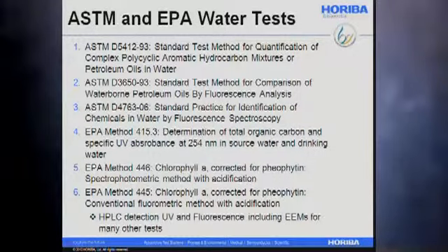There's also a number of standards tests that are being updated and revised to focus on the advantages of the new instrumentation, primarily, as I mentioned, oil and water analysis because of the new regulations and Coast Guard regulations, EPA and Coast Guard.